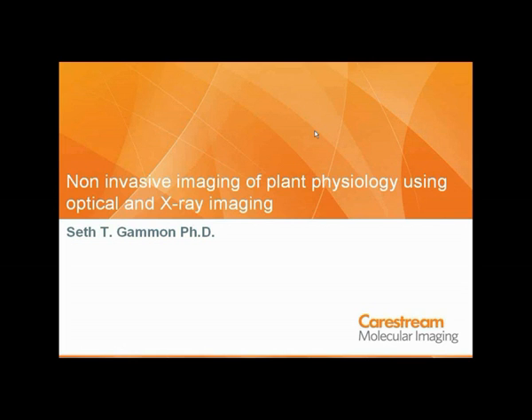Today I'm going to be talking about how to utilize our in vivo MSFX Pro for non-invasive imaging of plant physiology using fluorescence and X-ray, as well as introducing the capabilities of the instrument for conducting experiments using luminescent and radioisotopic capabilities as well.